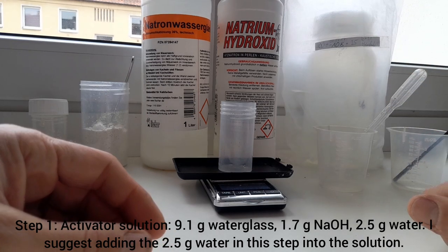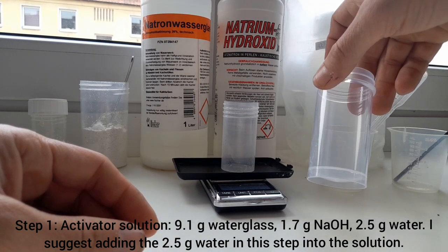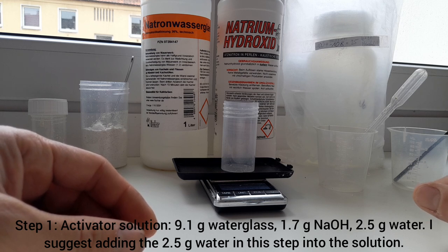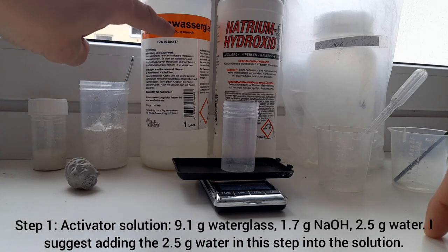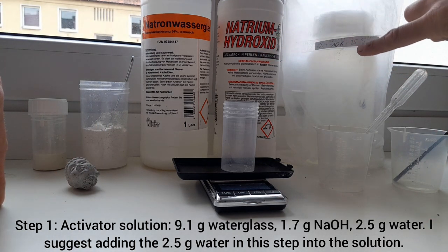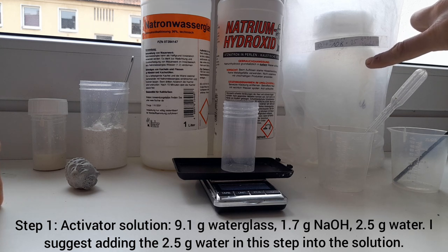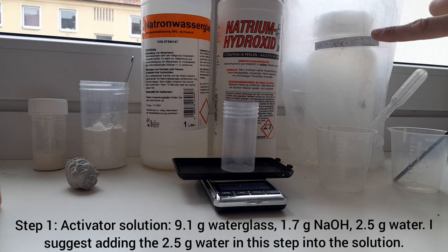If you want containers like this, you can get them on Amazon and make a number of test batches, which quickly gives you a good feel for the material. What we have here is a scale, the metakaolin, sodium water glass solution, sodium hydroxide solution, and a pre-prepared activator or hardener solution made at least 24 hours earlier.